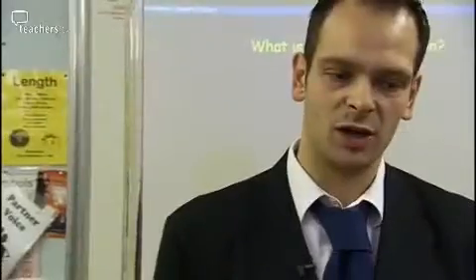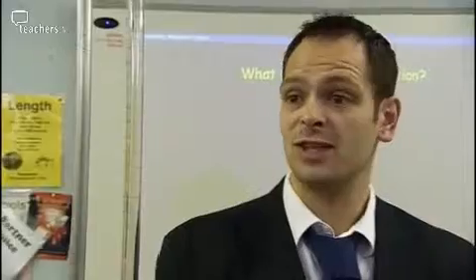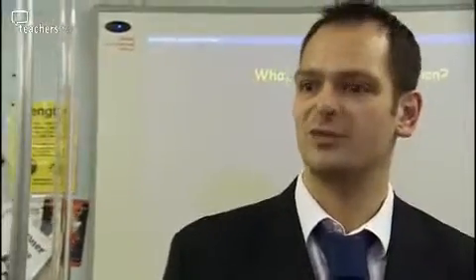Okay? Good. And as I go around, a lot of the conversations were, why is it 7 here? Why is it acid here? Why is it alkaline here? And they could pretty much answer those questions for me. And once they gain that kind of confidence, because it is just confidence, then they start to be more confident in what they're saying and they can understand it much better.